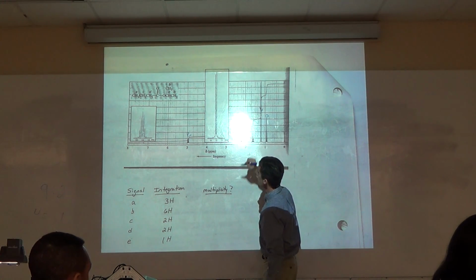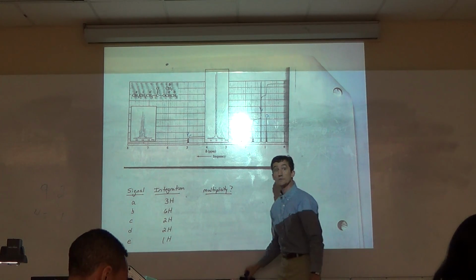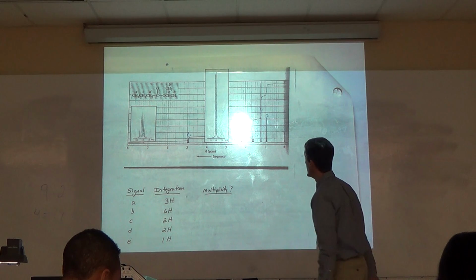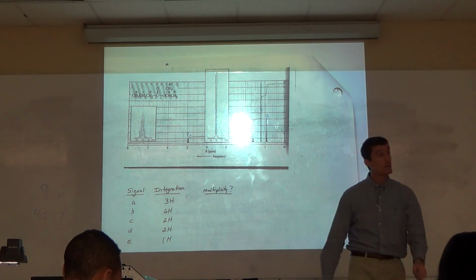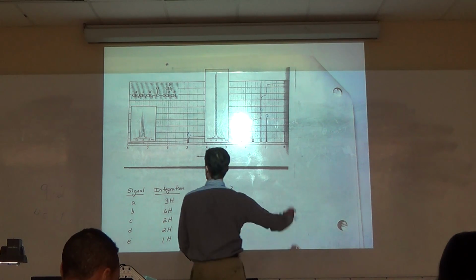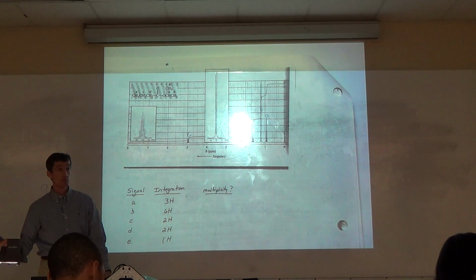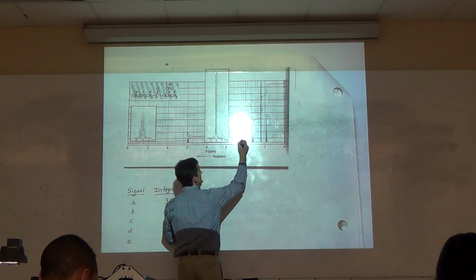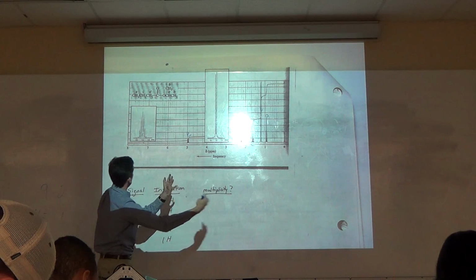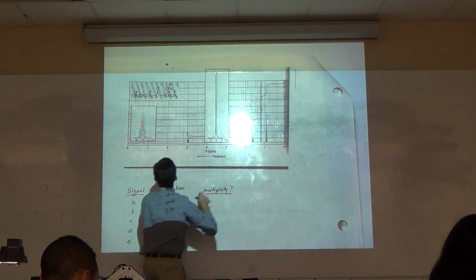We got 2 and 2, which is C and D. Which is which, though? Integration doesn't tell us, because they're both 2. D would be further down. C is more upfield, D is more downfield, because it's closer to that carbonyl. I would call this D and this C. As you get away from that carbonyl, D, C, A.